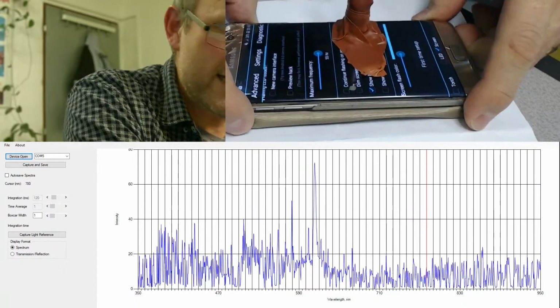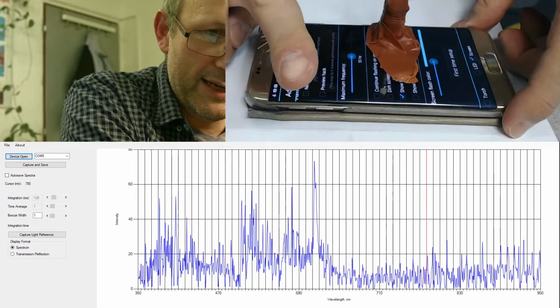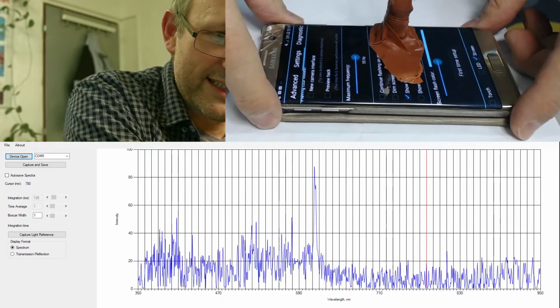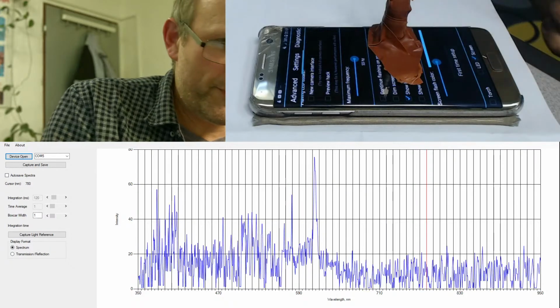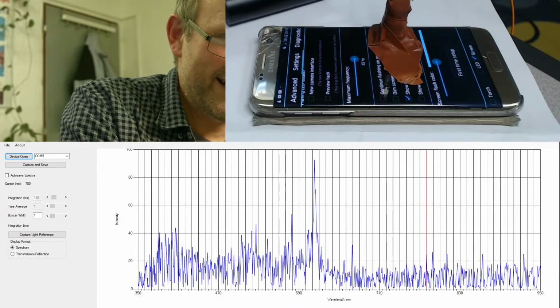So I'm going to put this into shot here. Now the reason I've got the white paper in the background is so that the webcam up here that's looking at it gets the white balance right, hopefully, and that will give you a better idea. So this is actually cyan that's here. Now I'll bring the strobe, the actual device, here in the background.